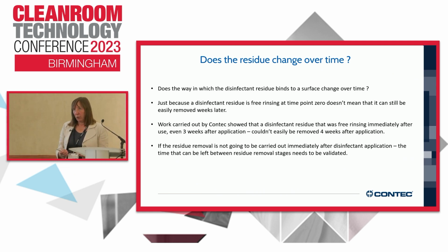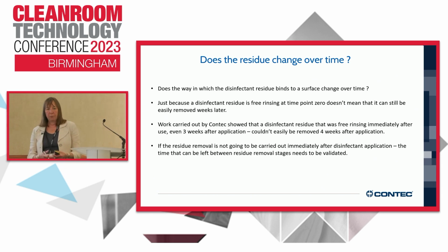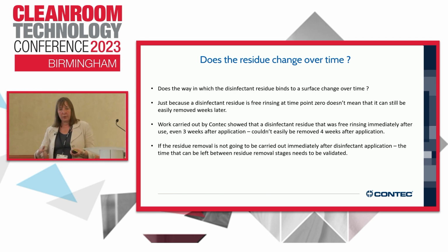So we did some work on a disinfectant that if you left it for a week and then removed it, or 2 weeks and removed it, 3 weeks, it was fine. By the time you got to 4 weeks, it had become much, much more difficult to remove that buildup of residue. So if you can't wipe to dry because the contact time doesn't let you and the product has dried, we would at least say, check with the manufacturer on residue removal and put something in place, whether it's once a week or once a month, to make sure that you keep it to a minimum.